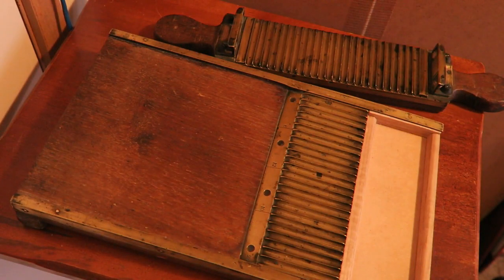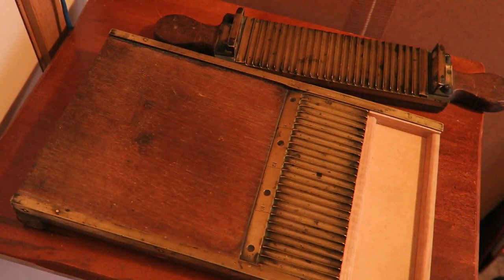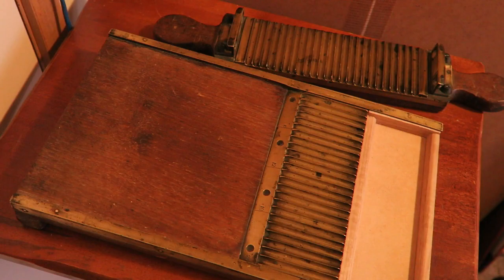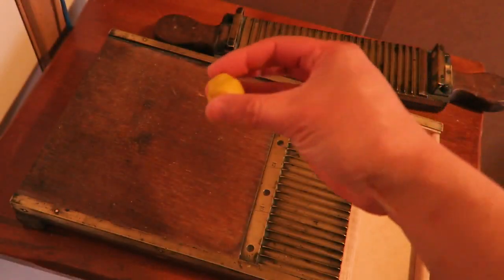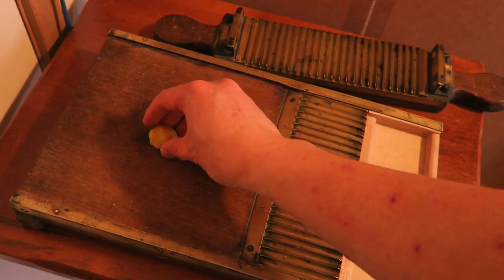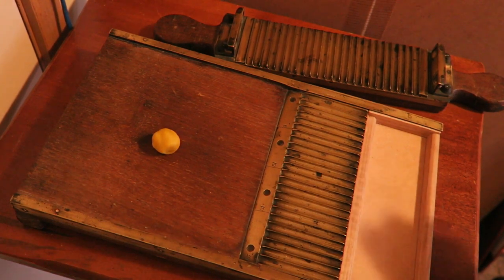So once he had the paste he would tip it out of here and then he would have to work it into a ball, into a mass — a single coagulated mass — and from that he could start making pills. Now, I've got some medicine here. This is highly potent play-doh medicine and I'm going to use this to show you how this thing worked. So what he would do is he would put his little blob of medicine there, and you need very little medicine to actually do this. This is probably more than enough.